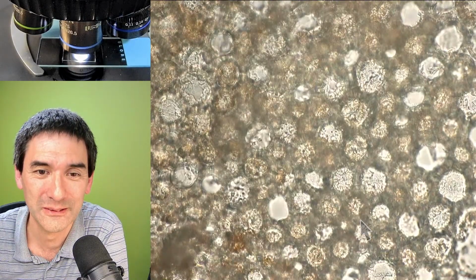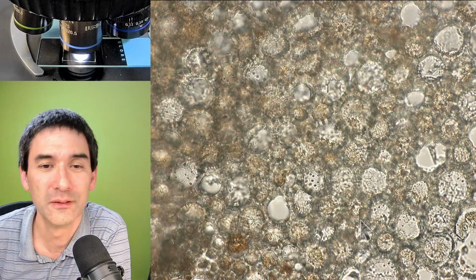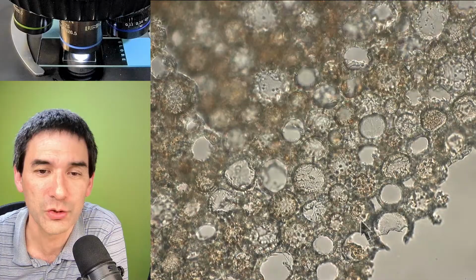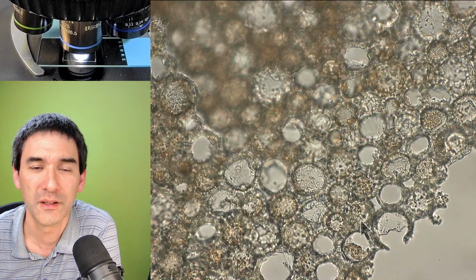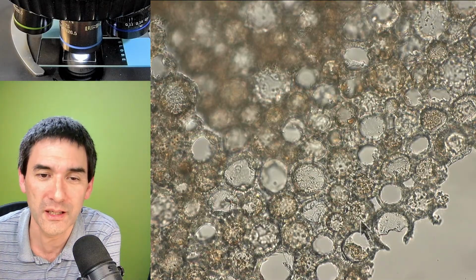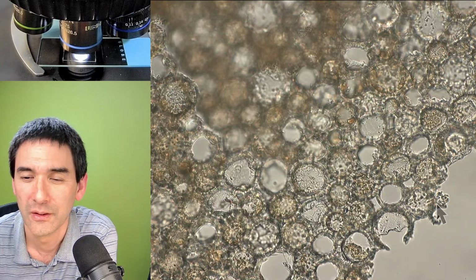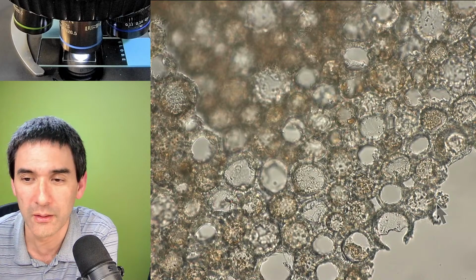So here, for example, that's quite nice. Here it's a little bit thinner. But we can also see that there is still some cell contents visible, not just the cell wall. This one was cut off at an angle, therefore it's getting thinner and thinner over here, until the whole thing is separated. Yeah, so bamboo does soften when you steam it, so I don't see why it wouldn't work.